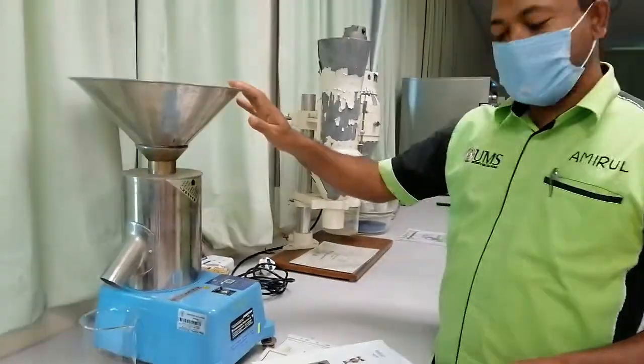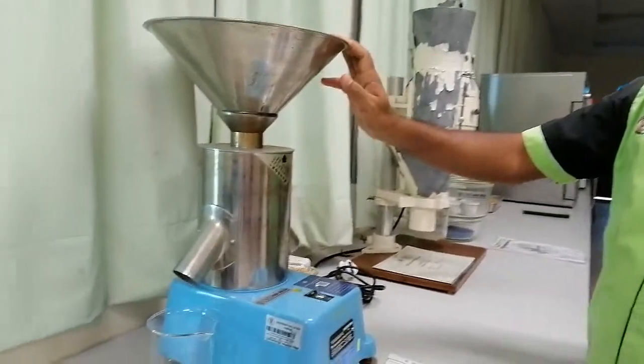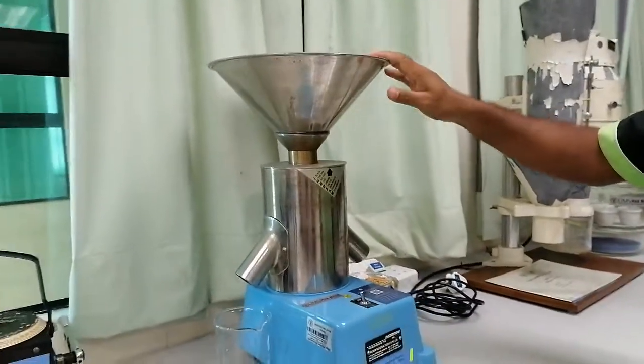Seed divider machine. This one is an electrical divider. This is also called the gamete or centrifugal divider.